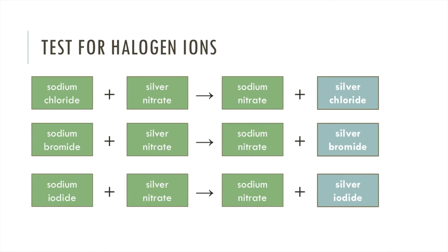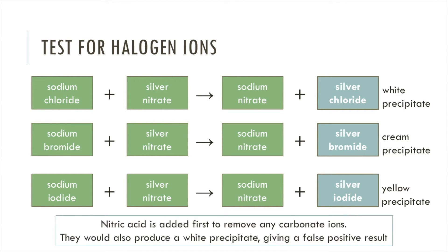Next is the test for halogen ions. Each of the halogens reacts with silver nitrate and this produces precipitates of differing colours. The silver chloride precipitate is white, the silver bromide precipitate is cream and the silver iodide precipitate is yellow. Before reacting with silver nitrate however we have to add nitric acid to remove the carbonate ions. This is because sodium carbonate and silver nitrate would produce silver carbonate, which is also a white precipitate giving a false positive result.